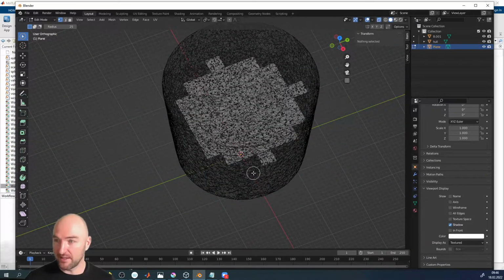So now you might think, why don't you just make an extremely fine mesh? The reason for that is making a mesh finer programmatically is always easier than making a mesh coarser programmatically. This may be a little bit counterintuitive because usually with finer, you think you have more information. But when it comes to meshes, topology is king, and topology is always a difficult bit.